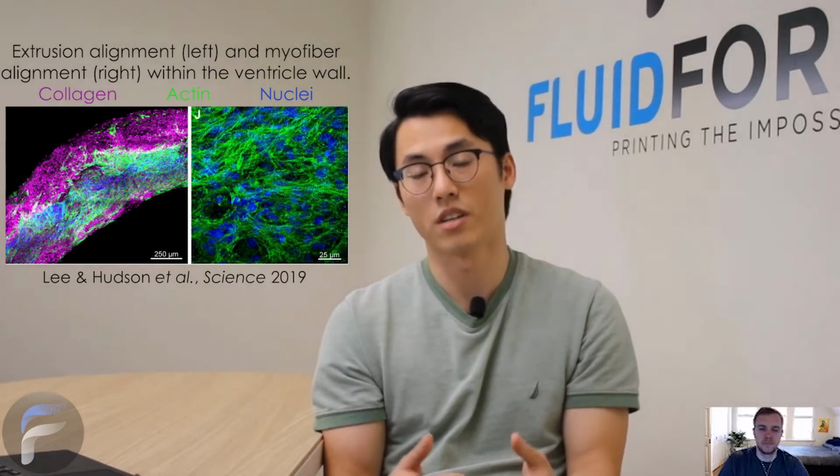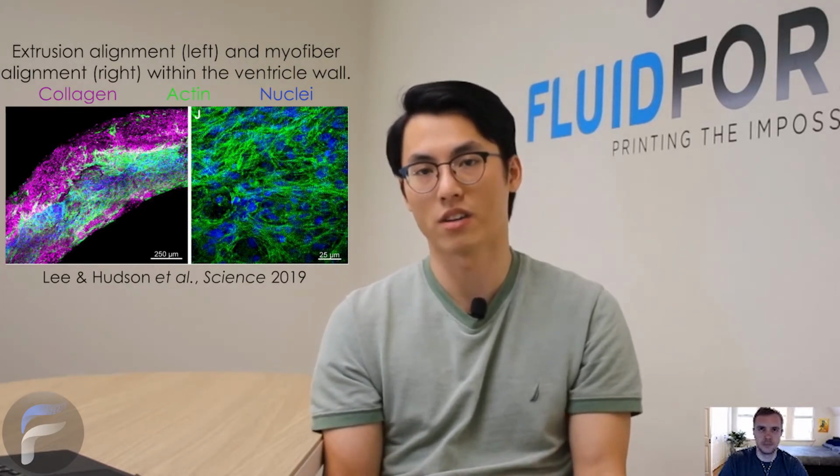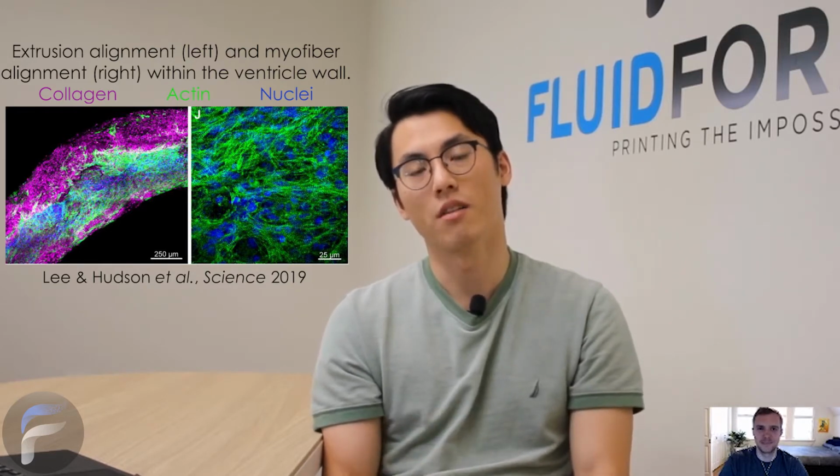And then we also saw that the cells really started to align, like we previously said. They aligned in the circumferential direction around the ventricle. So that got us really excited. And the next step was to take this alignment data. We know that they've aligned, and we can also visibly see that they're contracting. So are they contracting in the direction of that alignment? Which is what we hope to see.